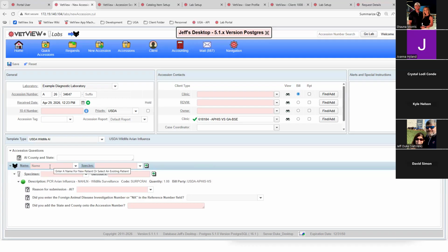It makes it easier to give this to anyone, because that's the thing with especially reportable diseases, we have to think about in what they call the wartime, or in a case of an outbreak. You may be asking people to step in and do receiving that aren't as familiar with the rules. What do I need to fill in? Where does it go? Where do I find it?